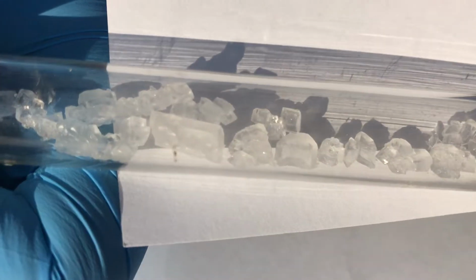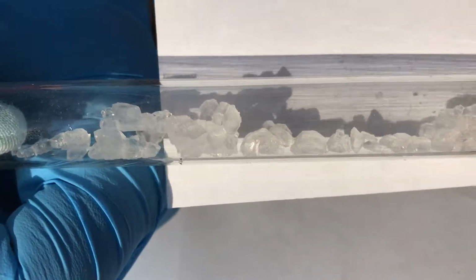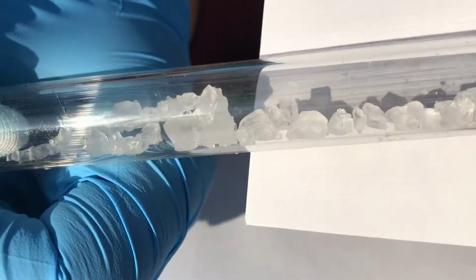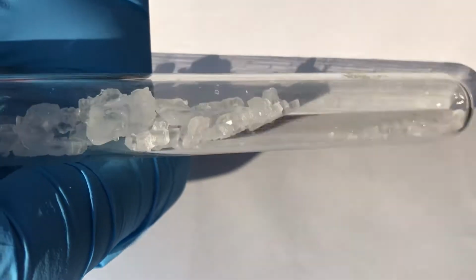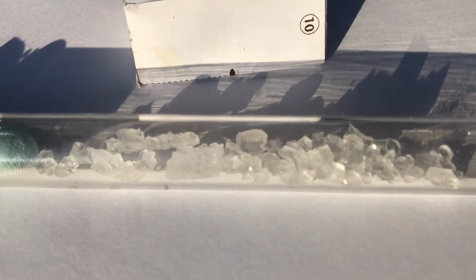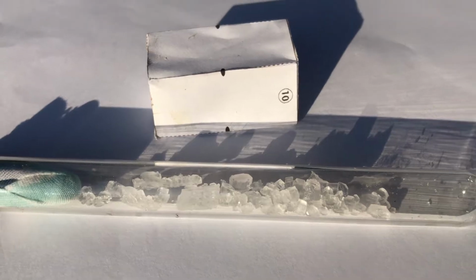Moving on, these ones are tiny little single crystals and polycrystals made from magnesium and potassium double sulfate. I have not managed to grow a big single crystal yet, however it is still growing. These crystals should have a basal pinacoid form or the form of a prism. In comparison to my origami shape, it is hard to observe a regular single crystal, however there are some.